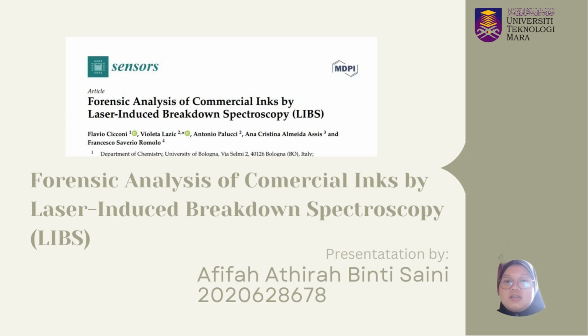AS253 6B2. Today I'm going to choose the topic under Laser-Induced Breakdown Spectroscopy, or LIBS, by referring to the article entitled Forensic Analysis of Commercial Inks by Laser-Induced Breakdown Spectroscopy.